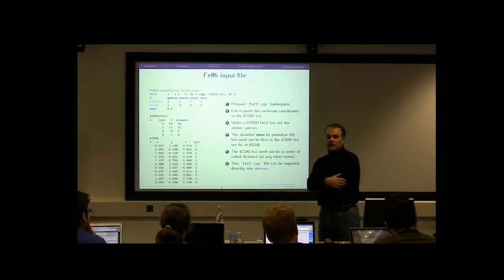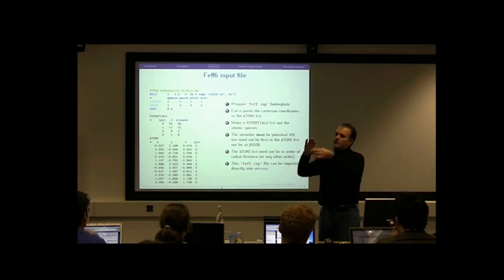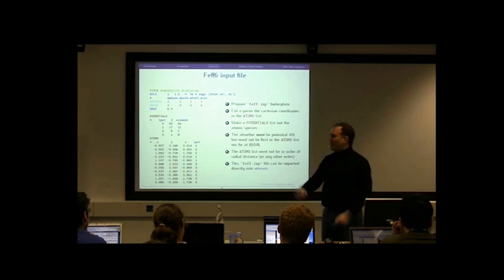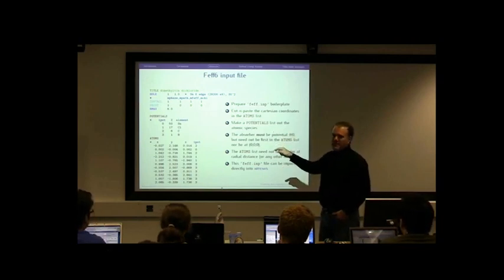So in the case of the uranyl, it turns out that it's fairly useful. You have these 2 really short oxygen bonds. It turns out to be useful to make those a different potential from the oxygens that are a lot farther away. That turns out to be a slightly better model of the potential, because an oxygen atom at 1.8 needs to be a lot smaller than an oxygen atom at 2.4. And so you can have like 4 and 5 be the same element if you have a good reason for doing so.